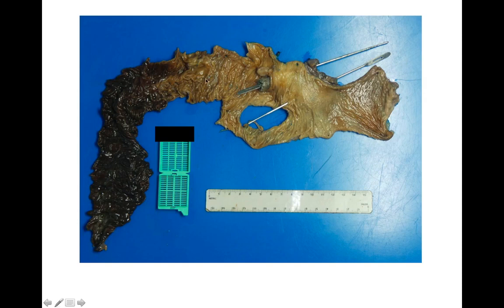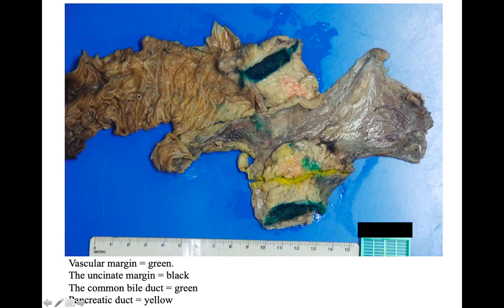Okay, here's the next case. Right over here you have the Whipple, you have stomach, you have a stented bile duct, you have potentially what is like the ampulla of Vater over here. So here they're not connecting. And then over here you could see a portion of duodenum, and it doesn't look great. It looks almost like ischemic. So here you go. Look at this.